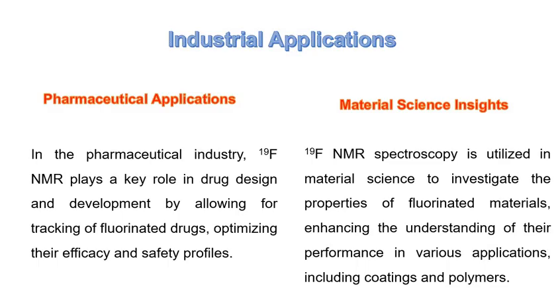Material science insights. F19 NMR spectroscopy is utilized in material science to investigate the properties of fluorinated materials, enhancing the understanding of their performance in various applications, including coatings and polymers.